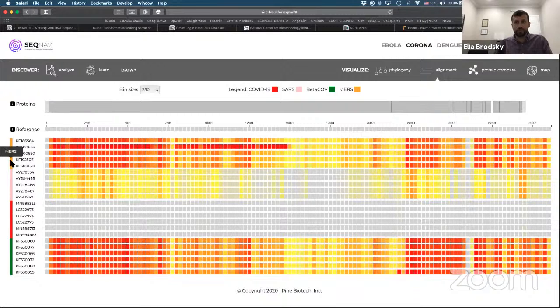Now, these groups of samples are organized by the type of coronavirus that they represent: beta coronavirus, COVID-19, SARS, and MERS, so obviously SARS-CoV-2. According to what you see in this visualization, which group is the most similar to the novel coronavirus that causes COVID-19?